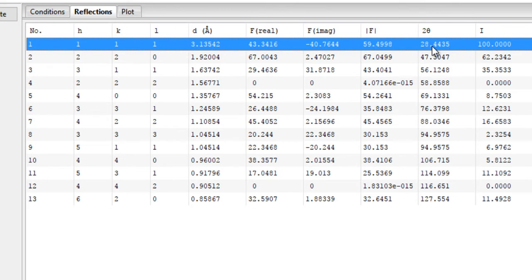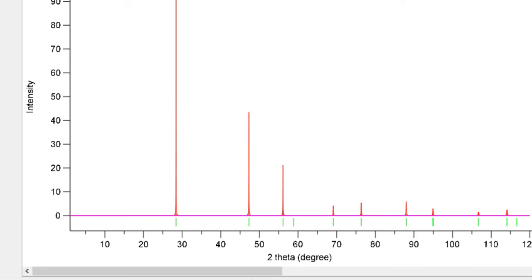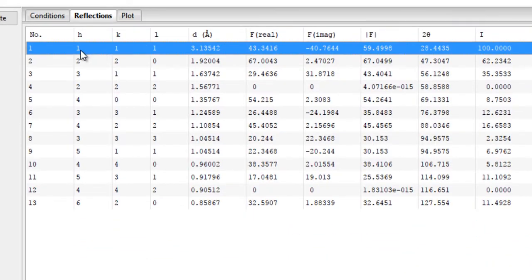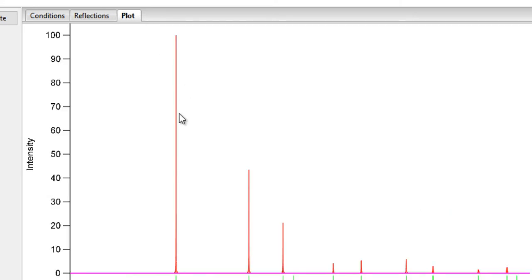The peak at 28 degrees right here has the Miller indices 111, that is it corresponds to the 111 plane. Then you have the intensity. As you can see, it was the highest intensity peak in this whole pattern, so it has been normalized to 100%.